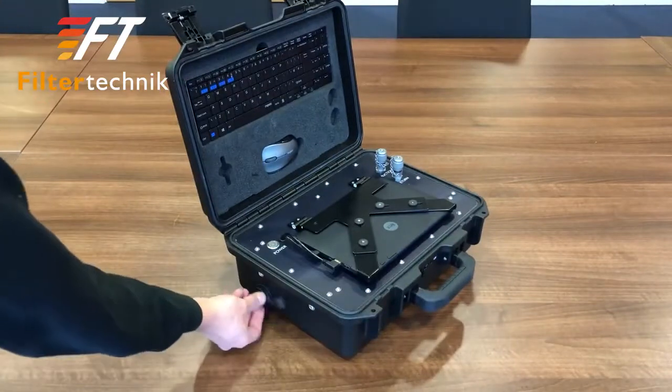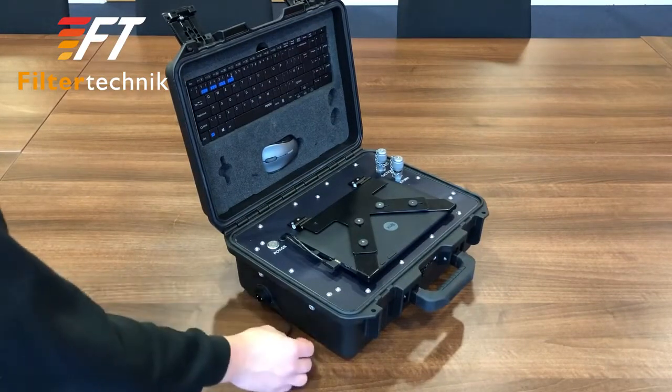To charge the unit, simply remove the cap on the left hand side of the case and connect the charging cable.